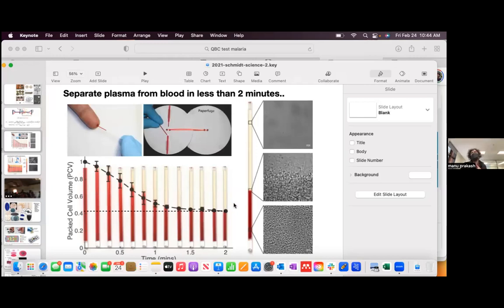So this would be an anemia test, for example. For a normal person, the volume fraction of plasma to RBC is at a certain percentage. And if you have anemia, that percentage shifts quite a lot because your RBC volume is low. And so this percentage ratio between the two will decrease. And this is a classic first test. And you can see here in the plasma, there are no RBCs. Right at the layer, there is that difference. And here, this is a completely packed volume.